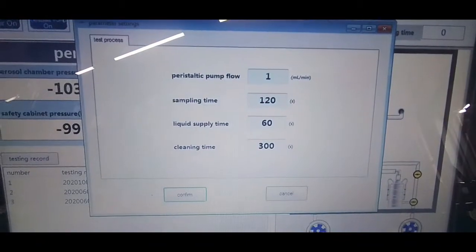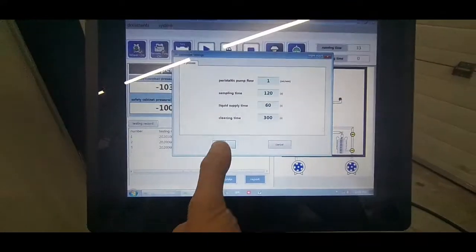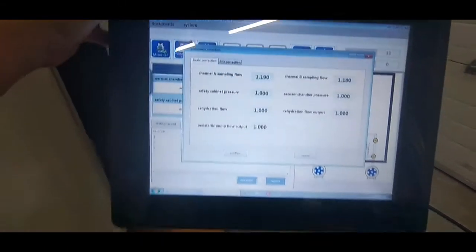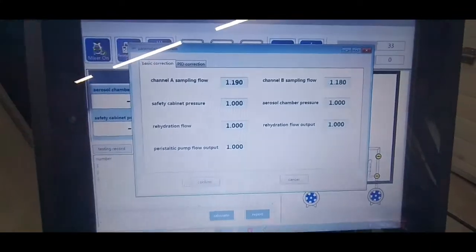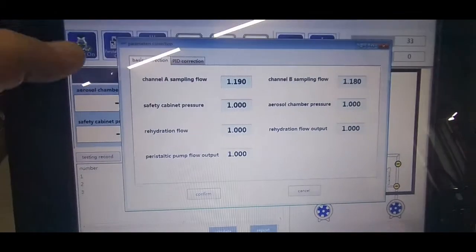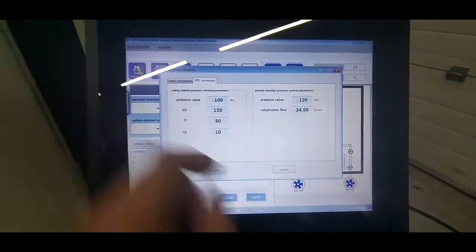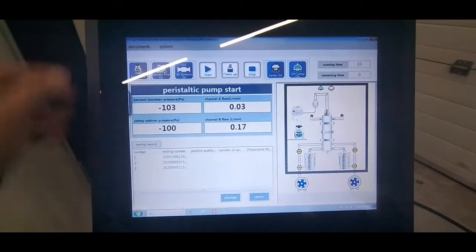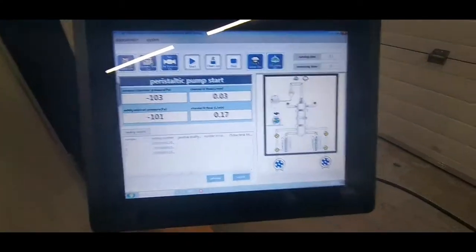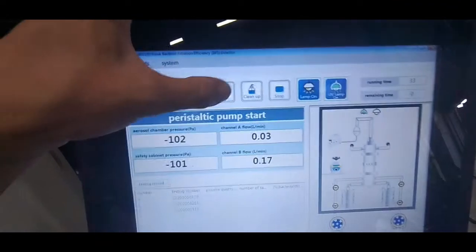You can set your test parameters here. There are basic corrections for calibration and calibration parameters here. You begin the test after setting up your entire setup by pressing the start button.